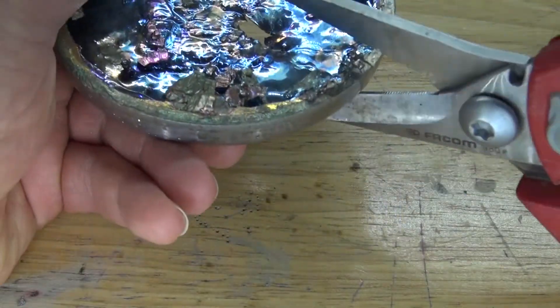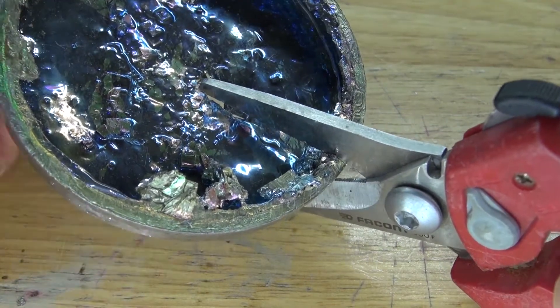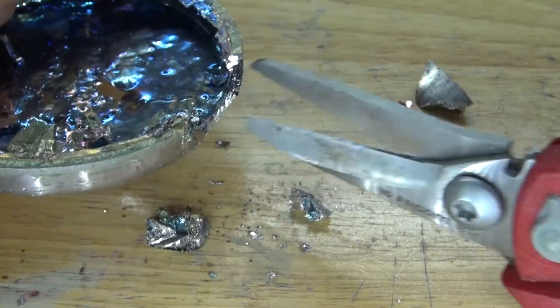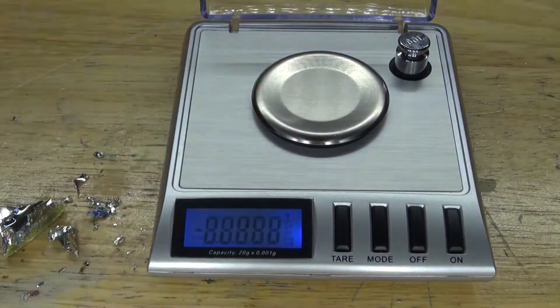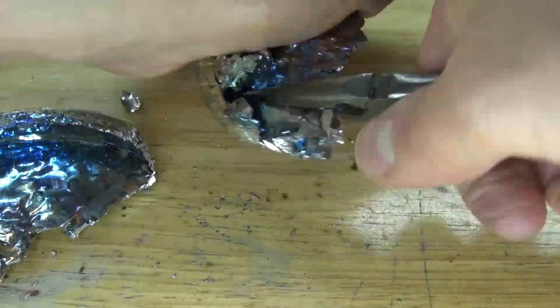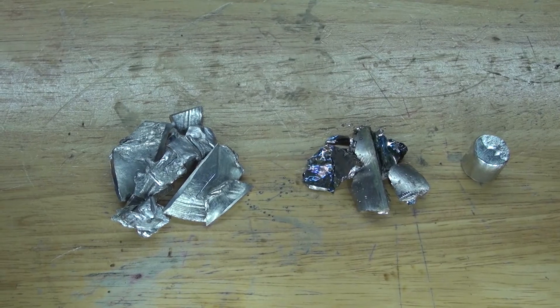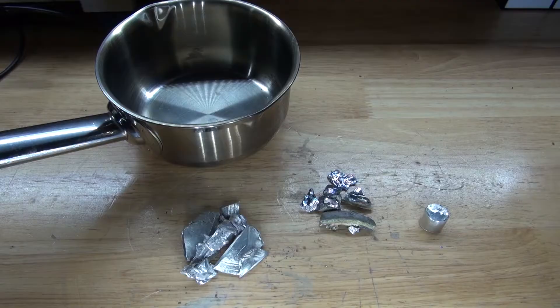Now bismuth — I'm going to cut a piece, and if you listen carefully, you can hear the crystalline structure cracking. Such a brittle metal. Gather up all the pieces and weigh it. And there, it should look just like this. I have all three of my elements ready: indium, bismuth, and tin. Now I need to combine all three together to create the eutectic alloy.